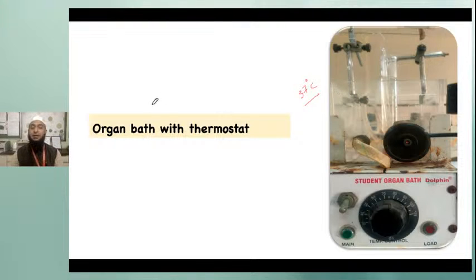To maintain that body temperature, you are using this thermostat. Generally, in an environment like Mumbai, where the room temperature is around 37 degrees Celsius, the thermostat is not required.